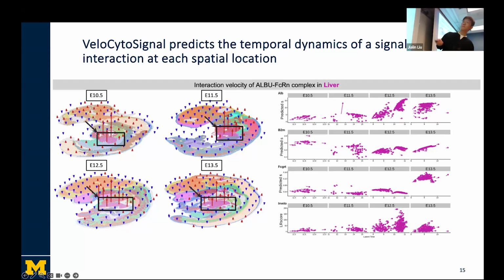And by having these 3D arrow plots, the red arrows mean it's increasing, and the length of the arrow indicates the extent of how dramatically it's changing, and the blue arrows indicate it's going down, the activity is decreasing. So you can see across four time points it really highlights this extremely increasing activity in the liver. And here are some arrow plots for the dynamics of each individual gene.